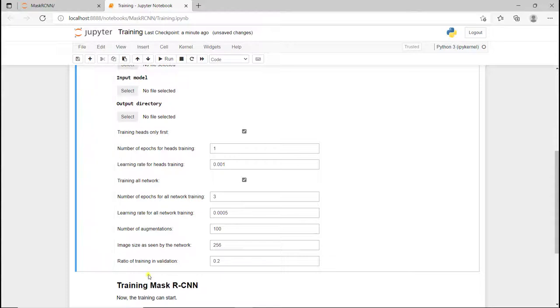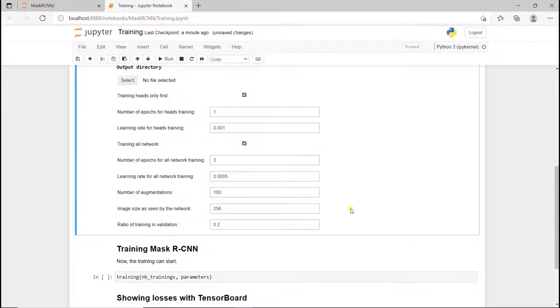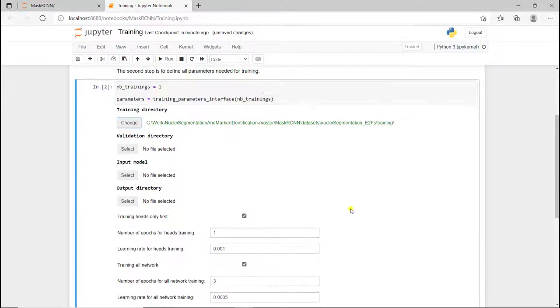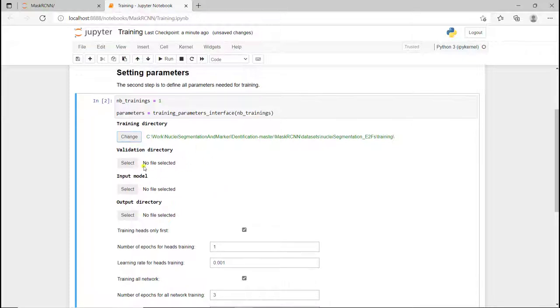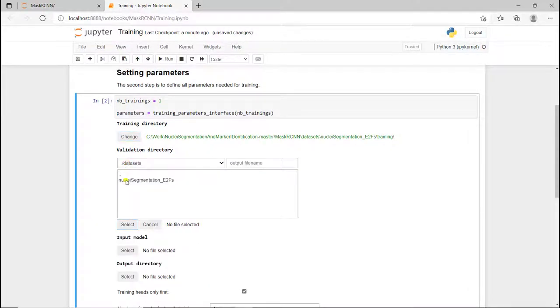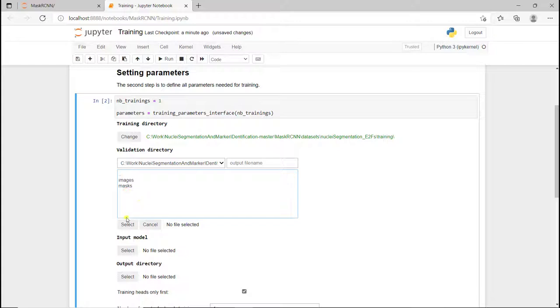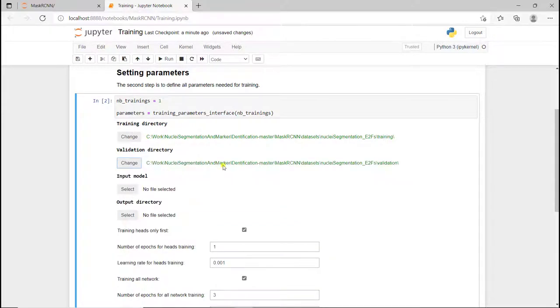The last parameter here would define the ratio of training data that is put in validation data if I don't define the validation directory, but here I have one. So I'm going to define it. It's going to be here.